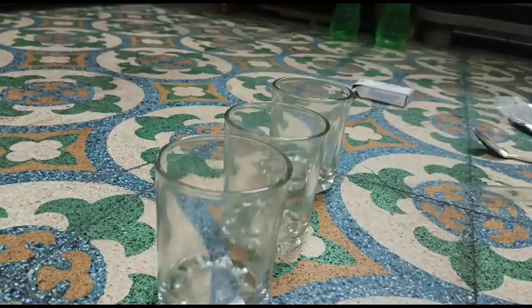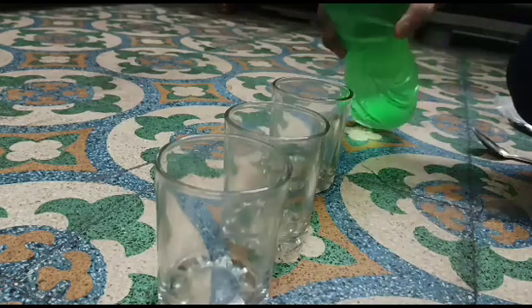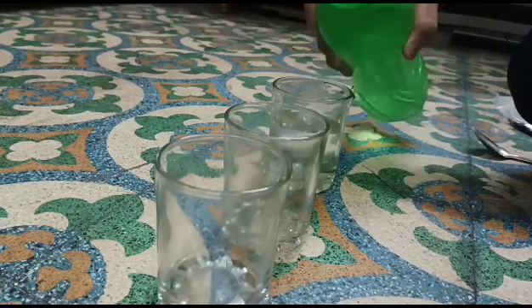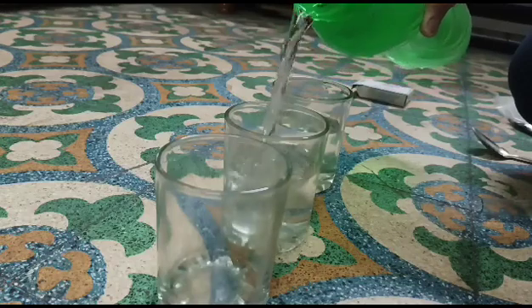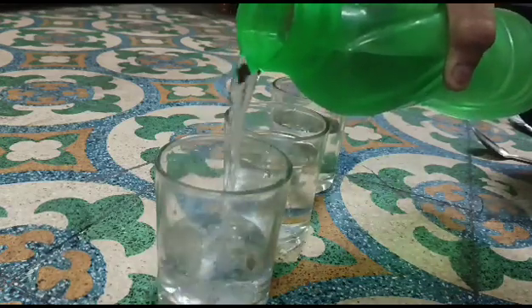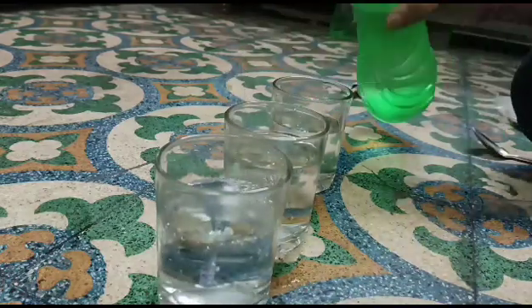Today our experiment is based on dilution, meaning estimating how small the particles of matter are. Now I have taken 3 glasses and I am filling them with water. Wait some seconds. It is not measured, but mostly it is filled the same in quantity.